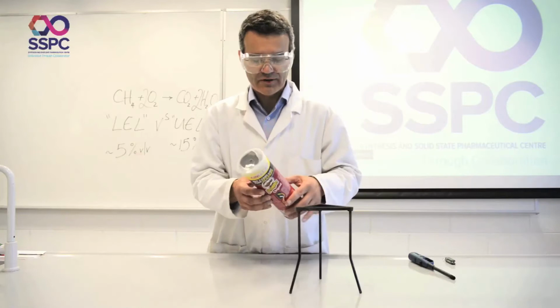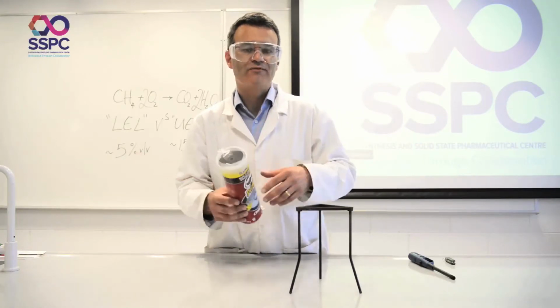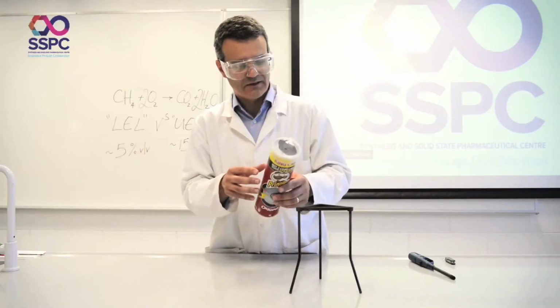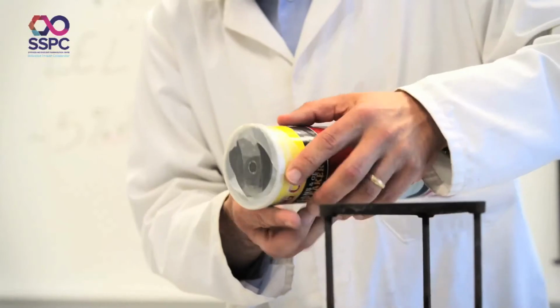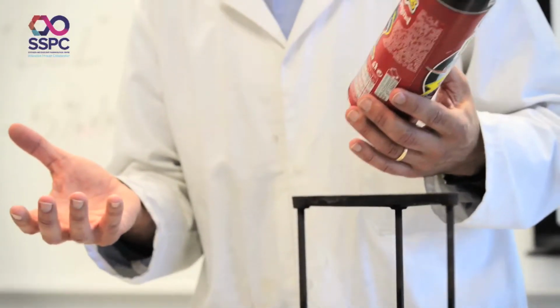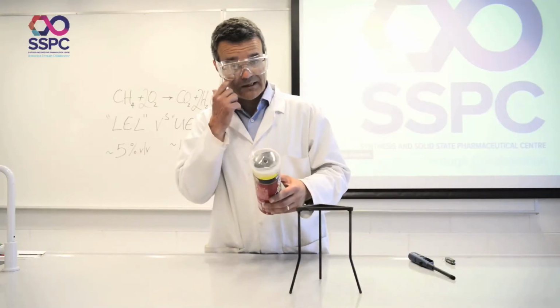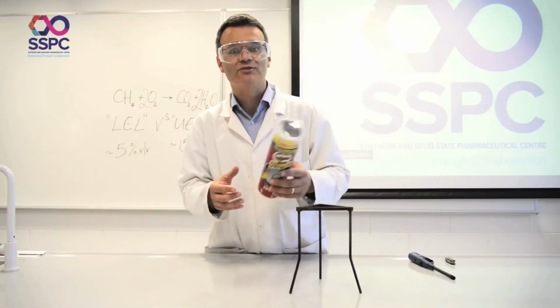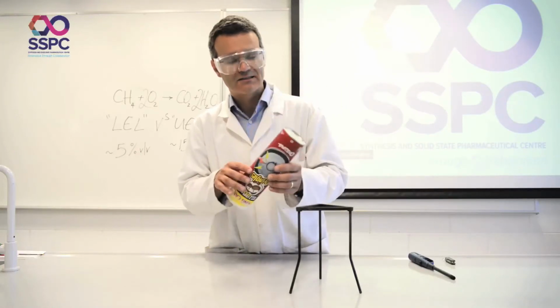When I've done this before, you can fill a tube with methane the night before, or before a class. Generally, if you fill it with methane, seal it with sellotape on each end, and have the cap sealed with a little bit of parafilm, it'll hold for 24 hours or thereabouts. Generally, I'll fill 2 or 3 of them just in case one happens to leak out. So we've a tube full of methane here basically, and that's the general gist of it.